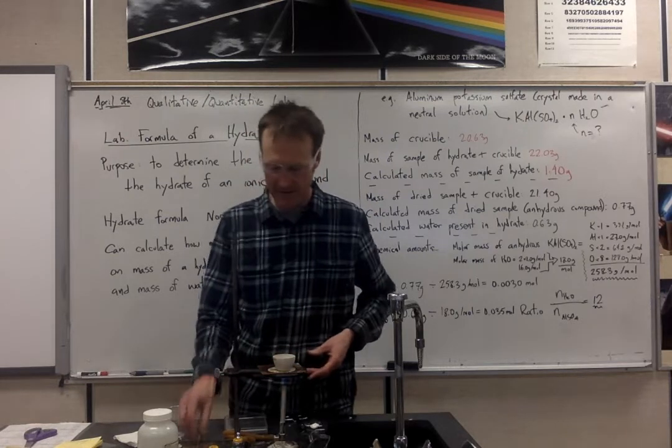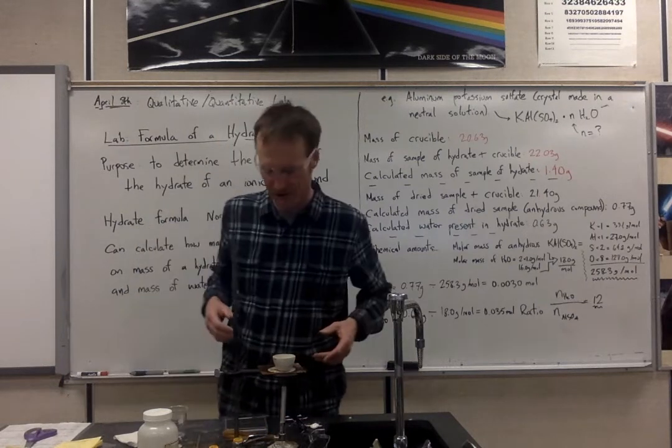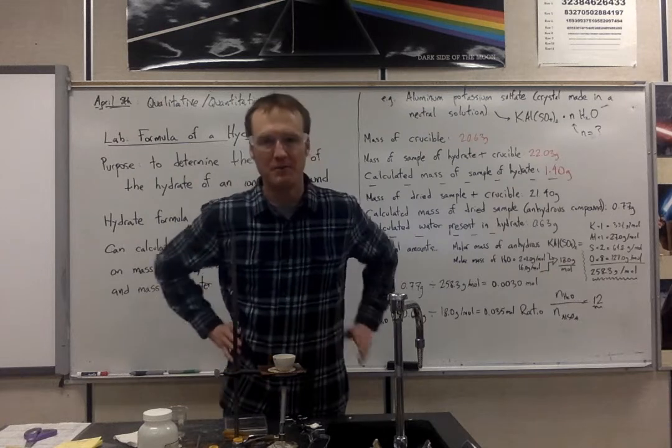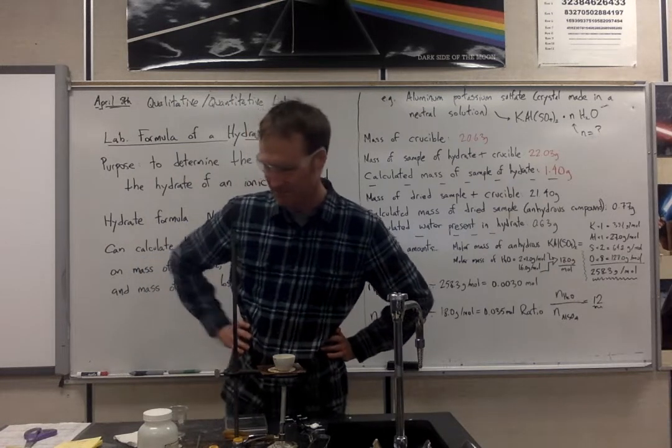It's very dry. I can tell that much. Good enough. I'm going to turn off the burner. I'm not going to put this right on top of the scale because I might wreck my very nice scale.